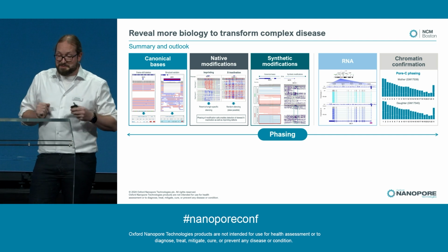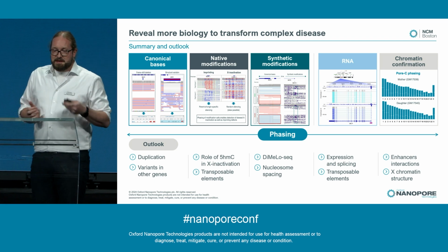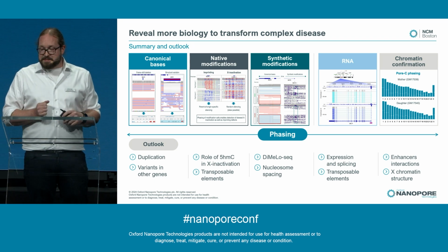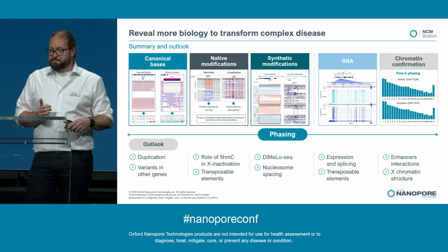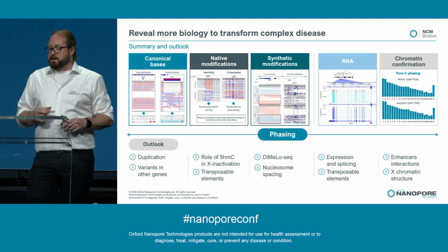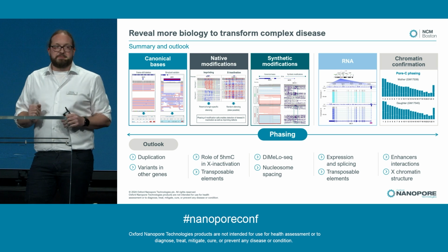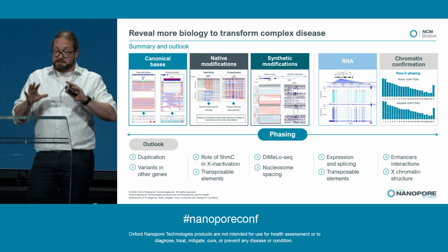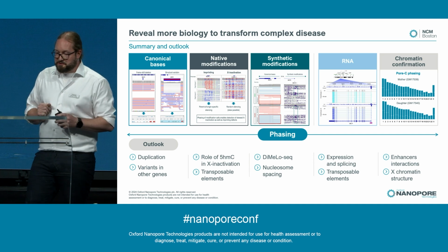And now the last thing I'm going to say is that we're really just scratching the surface here. MECP2 is a fascinating gene. It does loads of things. It binds 5mC, 5hmC, and modulates transcription and affects chromatin accessibility on a large scale and on a small scale. So there's loads to explore, and we could explore this with this data set, but that might be a talk for London Calling.